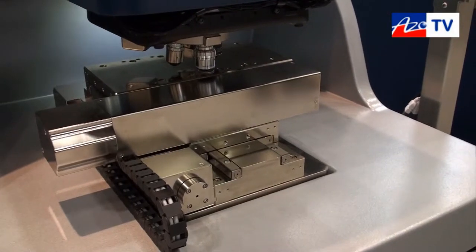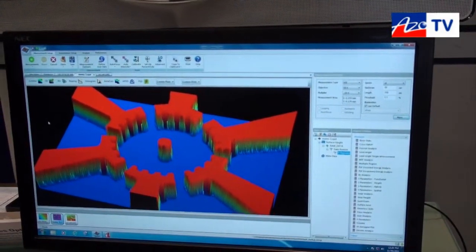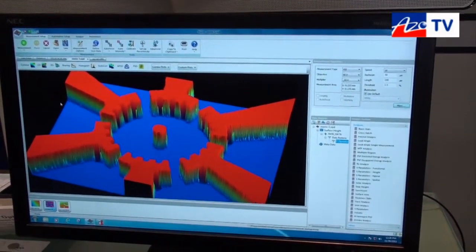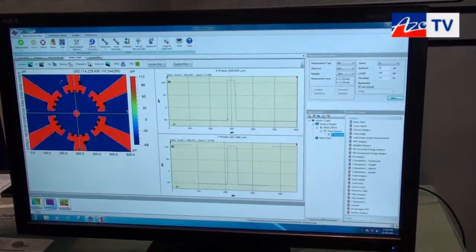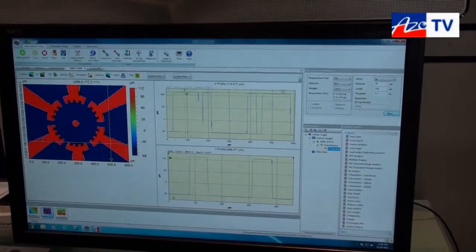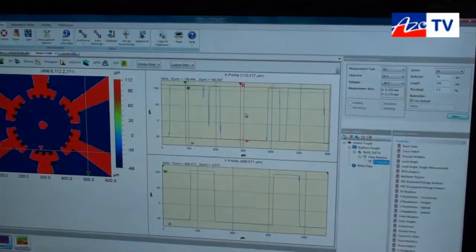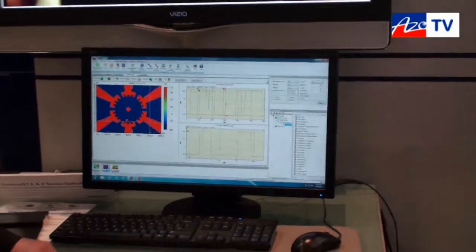A typical image is shown here. This is of a MEMS device — what we're looking at is a 3D rendering of the device. The software has a very intuitive interface and contains all of the standard roughness parameters: R parameters, S parameters, and a wide variety of tools for measuring surface height, surface finish, and surface roughness. You can see we're drawing cross-section lines through this device and can simply measure the delta X, delta Y, and delta Z dimensions of the feature. The instrument has a broad range of applications covering everything from automotive parts to medical implants, pharmaceuticals — really anything that can be placed under the microscope that will reflect light.